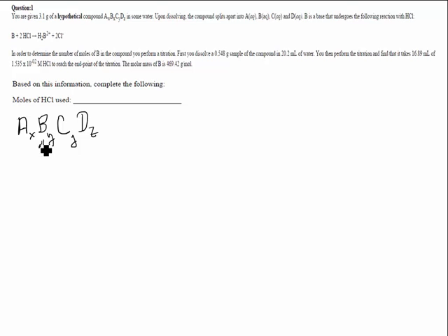So this week, we're focusing only on B, and we're calling it B because it's a base, which means that a base reacts with an acid to give, not always water, that's one we did last week, H plus OH minus to give water. It can just give a neutral compound. And that's what's going on here, and that's all you're being asked to do.